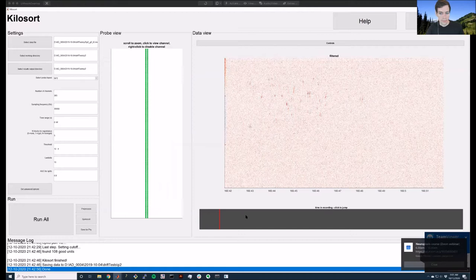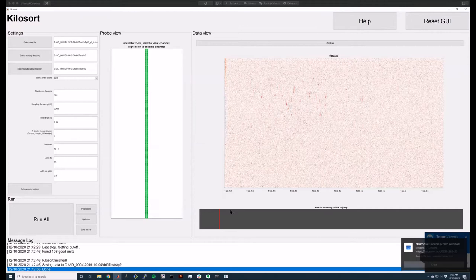I'm going to go through this Kilosort GUI that Maria has already shown you and say a bit more about what the controls and settings are.